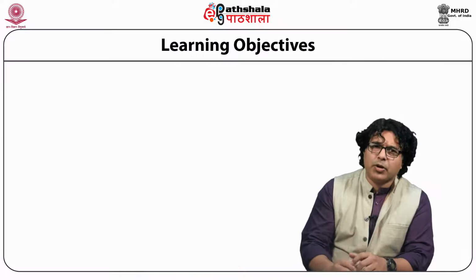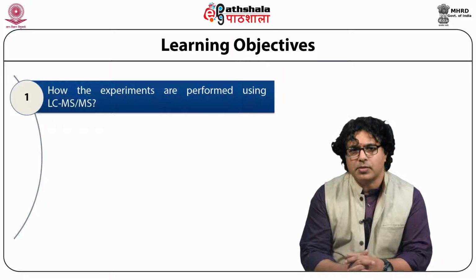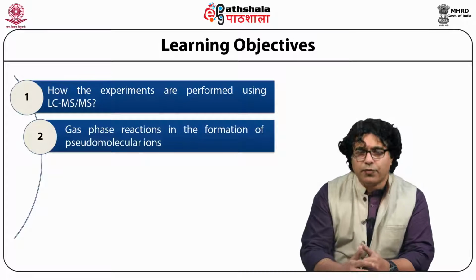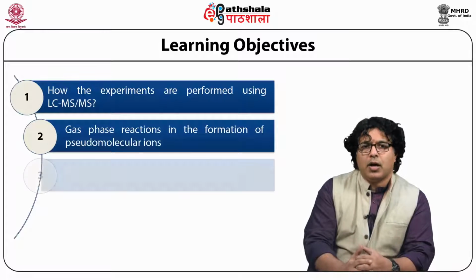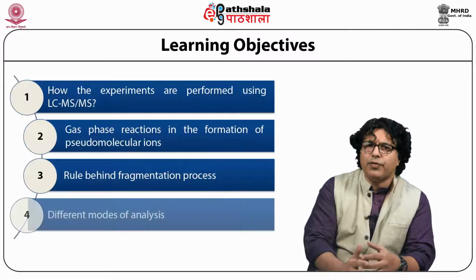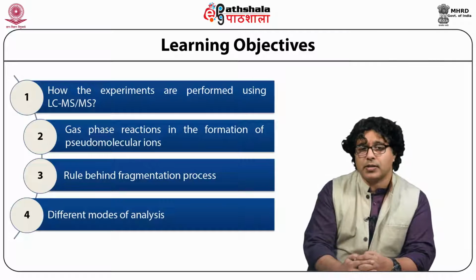In this module, you're going to see about how the experiments are being performed using LC-MS. What are the gas phase reactions happening in the formation of pseudo-molecular ions, rules which are applied behind the fragmentation process, and different modes of analysis. These are all the things we are going to say in today's talk.